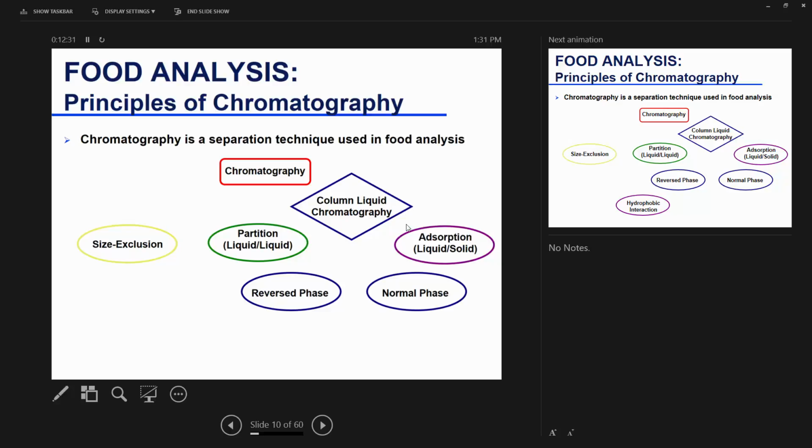And it is called normal phase for one simple reason. It was discovered and used before the reversed phase. So first they started doing polar stationary phase, nonpolar mobile phase, and then they swapped. They discovered material that they can have as a nonpolar stationary phase, and then your mobile phase became polar, so they just said reversed phase. They reversed it.